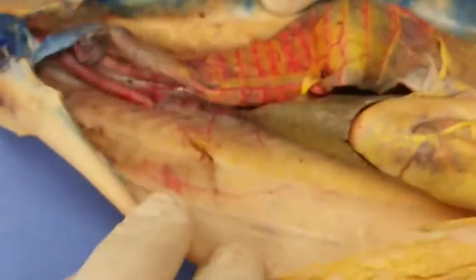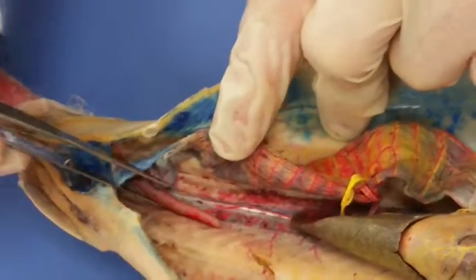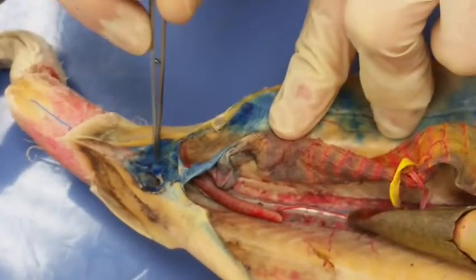Then, looking for all the world like a gigantic penis, we have the rectal gland right there. Highly scientific. It leads down into the rectum again down here.